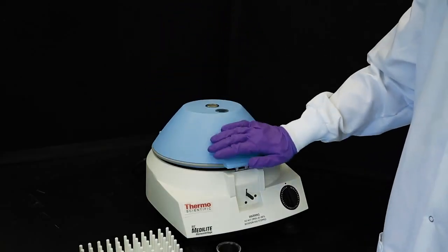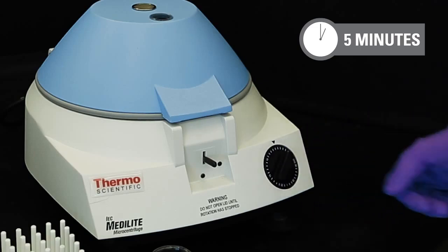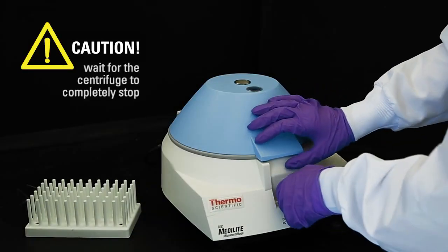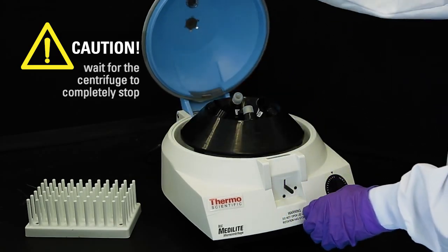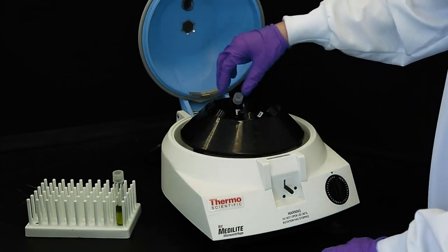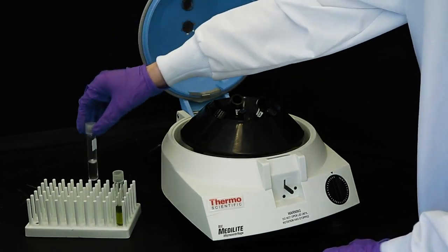Close the lid and turn the dial to 5 minutes. Do not open the lid until the centrifuge has come to a complete stop. Remove samples from the centrifuge. Identify each sample based on its recorded position number.